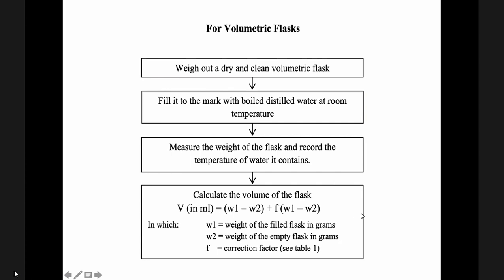Tapos lang, no? Pero kung wala ka mo kabalo, mahambalambing ang calibration of volumetric flask, do ka budlay how. But when you see how it is done, tapos lang. So you have to do this 3 times.